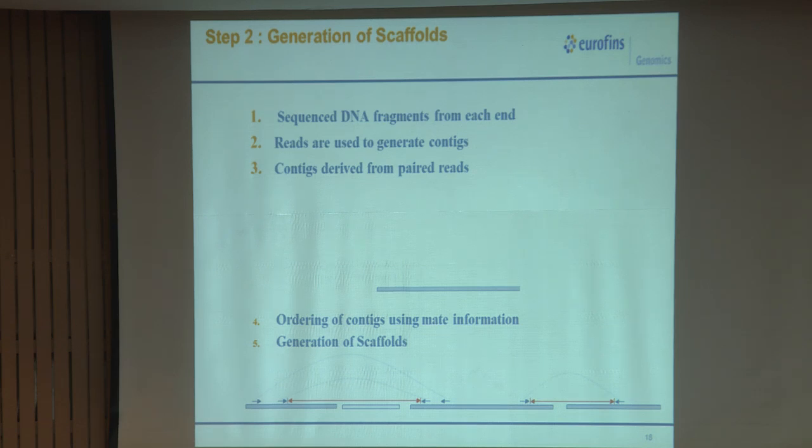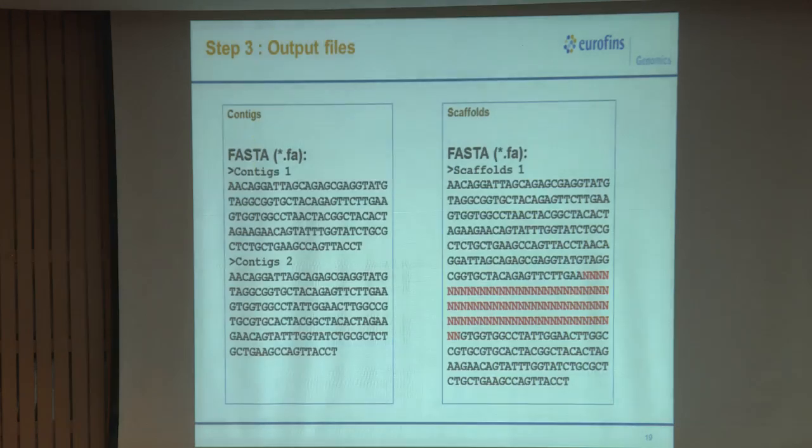So, to capture those regions, these insert sizes help us, or else long sequencing will help us. If my long sequencing read maps here, gets a significant overlap here, then I can say exactly what the sequence here is, and this can connect these two contigs together, right. This is how we connect the entire genome and get to a scaffold level of the genome.